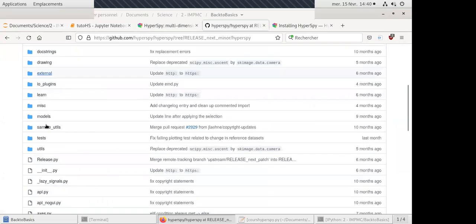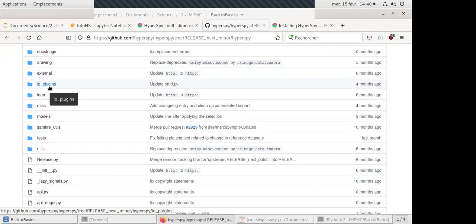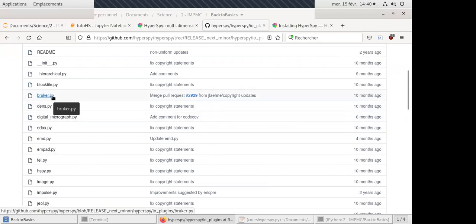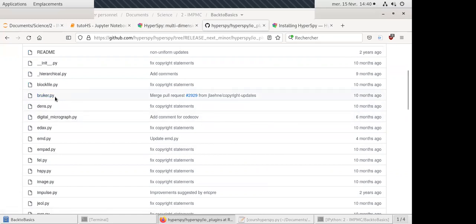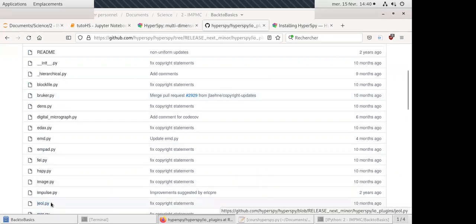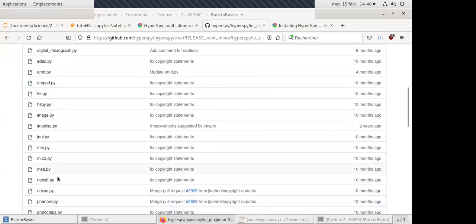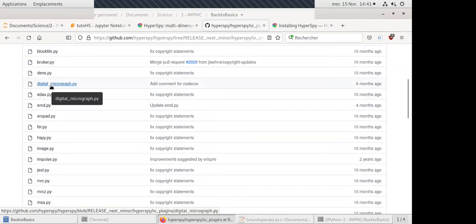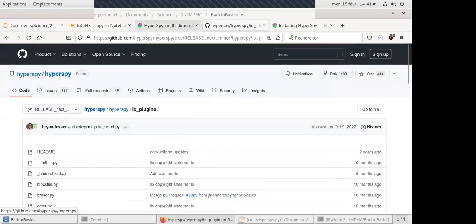On GitHub you can check the project — there are folders with different kinds of functions. For example, the IO plugin folder contains all the scripts people contributed to read different file formats. Here you have the Bruker BCF reader. When you use the load function, it detects the BCF and calls the right function. I also coded support for GEM datasets, so you can see there are many file formats readable with HyperSpy, including Digital Micrograph.